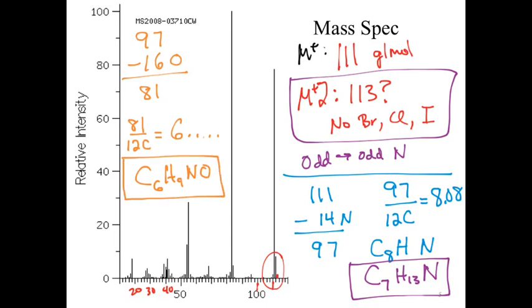We could try and go through and subtract a carbon out of this and replace that with our hydrogens. Not the greatest idea because we'd have too many hydrogens for the structure. We wouldn't be able to actually hold that many. We could have more than 1 oxygen, so we could again go back in and crunch those numbers. I'm not a big fan of calculating out these formulas because you could propagate out 3 or 4 or 5 different formulas and it just doesn't make sense. What I want you to see is at least 2 so you get an idea on how we went through and did those calculations. So we would now go back to our chart and we'd summarize this information into it.